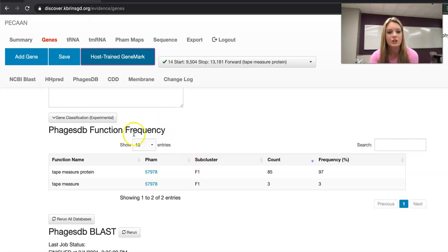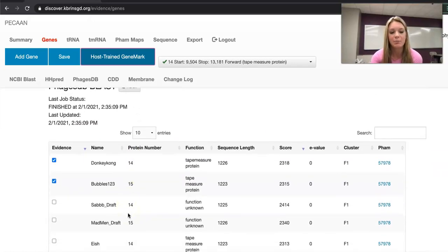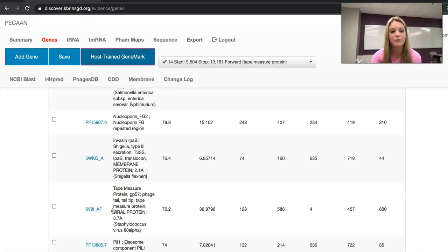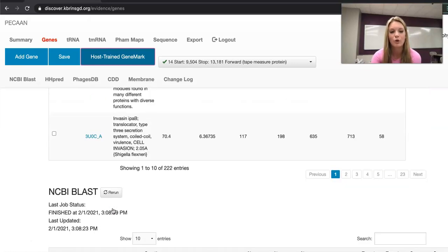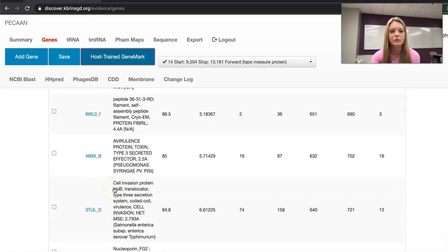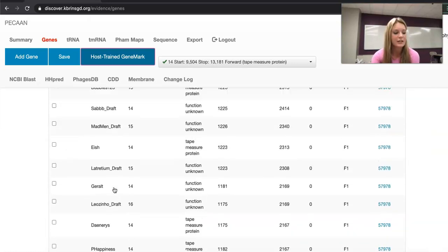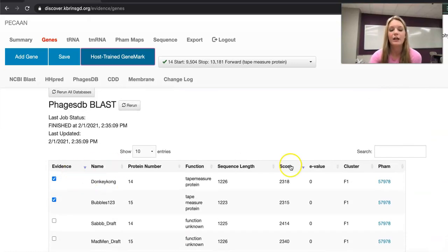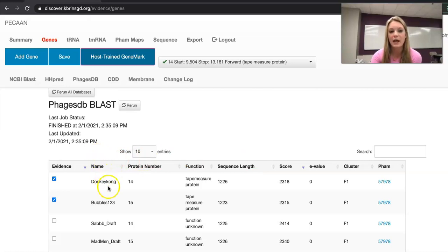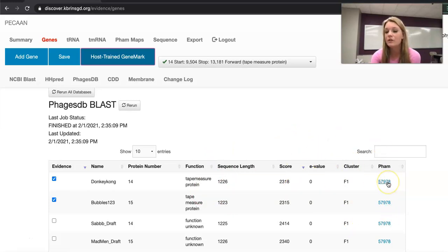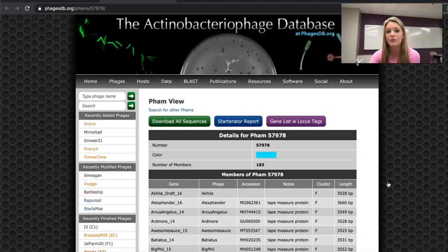Below this section you're going to see PhagesDB blasts and if you scroll down HHPred, scroll down some more and NCBI blasts. Each of these have different information columns. PhagesDB has the name, the protein number, the function, the sequence length, the score, the e-value, the cluster, and the FAM. If you click on this link FAM it's going to take you to the FAM view.